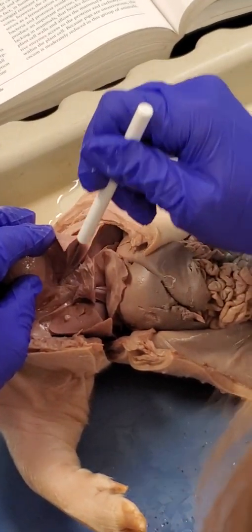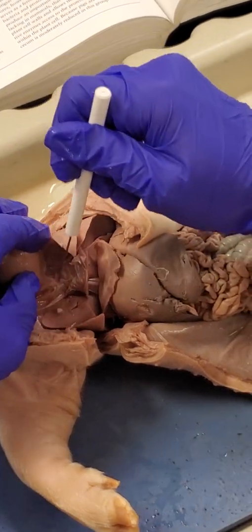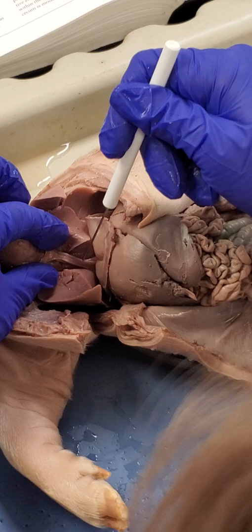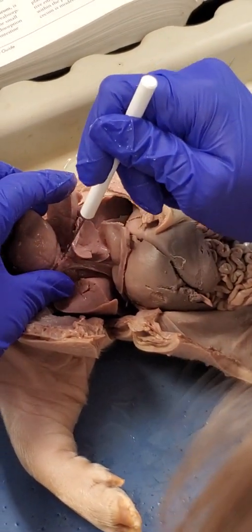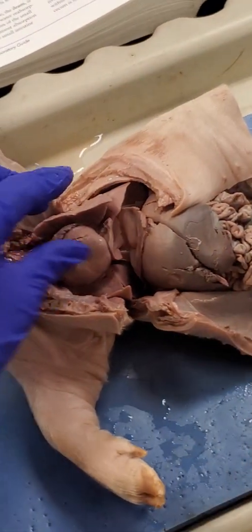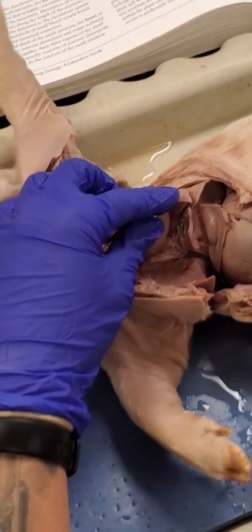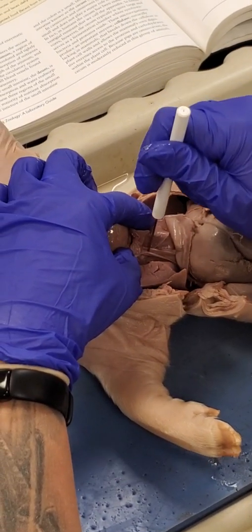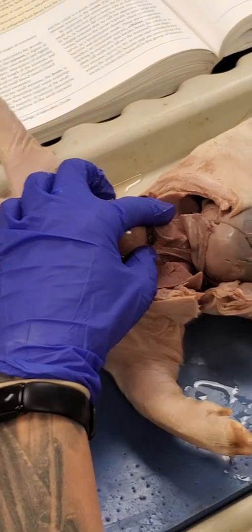So it's that white stuff under there? Yeah, this is some connective tissue. We could cut it away, but see this right here? It's going to be this, and it's going to come right back in there. Okay. So like a little bridge. Mm-hmm. I could probably pin it right there, just to be clear.